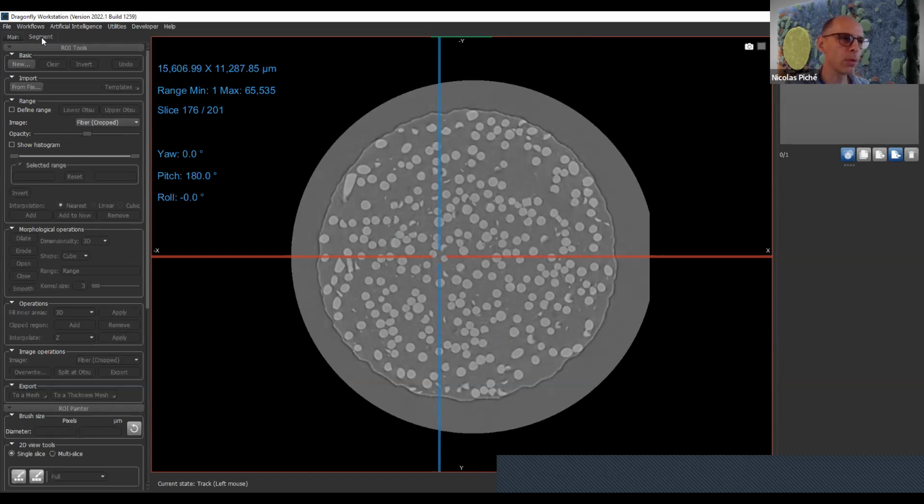Why would you have both? Oh, it's a good question. We started with the first one, and now someone could say we should just use multi-ROI. The advantage of a multi-ROI is that they're auto-exclusive. So one pixel can only be of one color. So it's the appropriate tool to train a neural network for 4 colors, because if you have 4 different ROI that are all living in space and that are overlapping, what do I do with the confusion of the class, you know? And yeah, but ROI are still interesting to be used sometimes. They are lightweight.